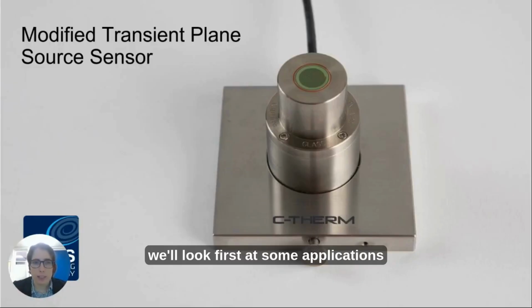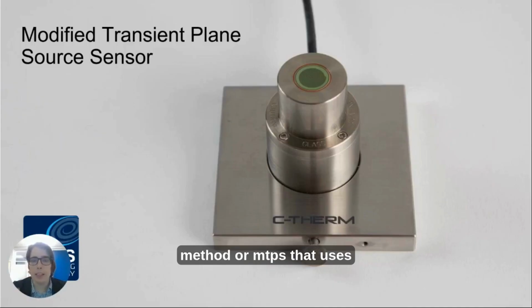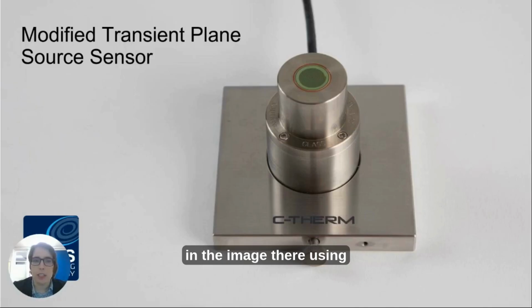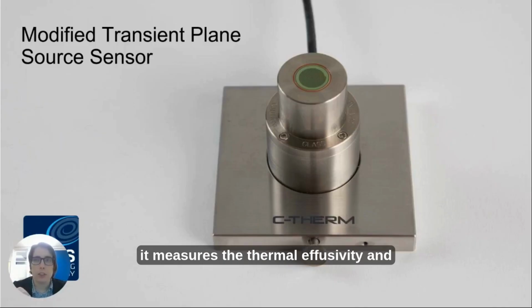We'll look first at some applications that are appropriate to the modified transient plane source method, or MTPS. That uses the sensor that you see here in this slide. So this is a calibrated sensor. The measurement takes place on the green chip that you see in the image there, using a modified transient plane source method. So it measures the thermal effusivity and also the thermal conductivity.